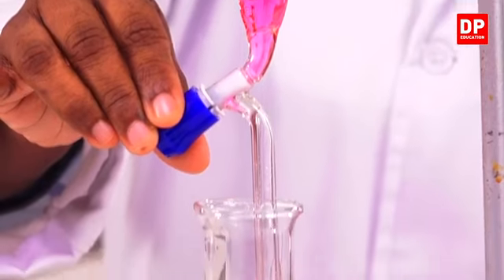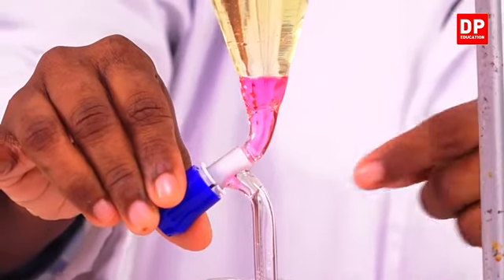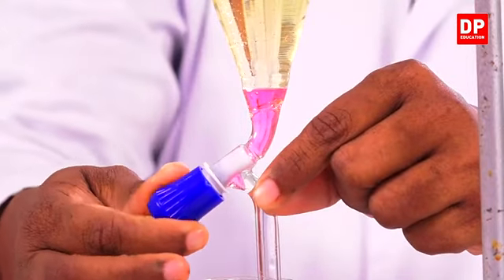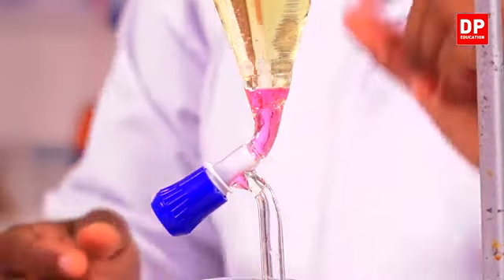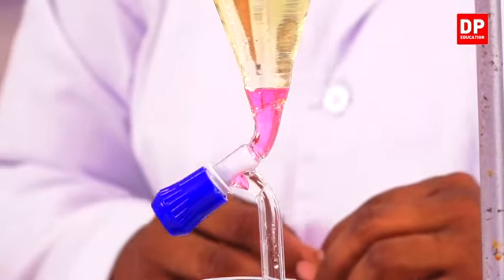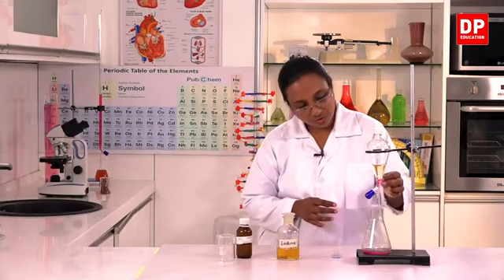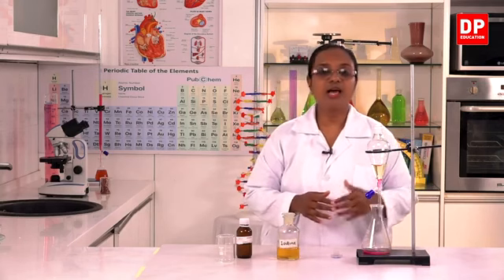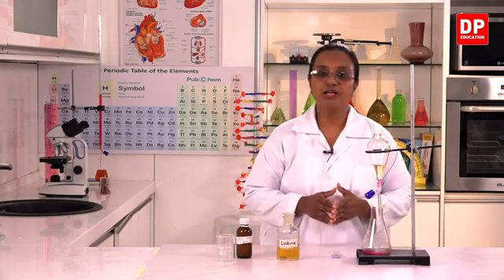And when it comes to a point where this interface, the point where the two solvents meet, I will close the funnel. So here I have left a certain amount of that other mixture here so that it doesn't get mixed. You can even draw a little bit more of the carbon tetrachloride layer so that we have most of the iodine in the conical flask.